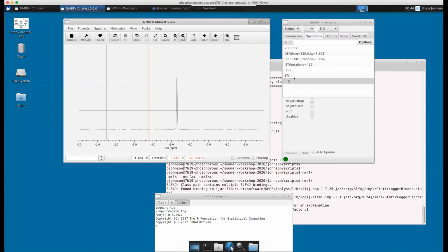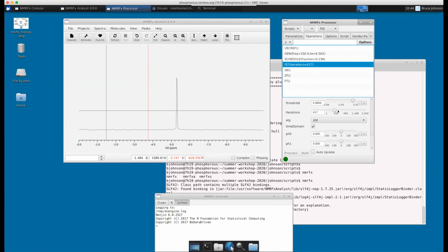Before you jump into the next topic there, you've got one more person with their hand raised. Alexander? Yes. Oh, yeah, that's Alex Lesky. I just noticed about iterations there in the IST. Actually, if you start increasing it beyond 500, it seems like you get more artifacts, right?